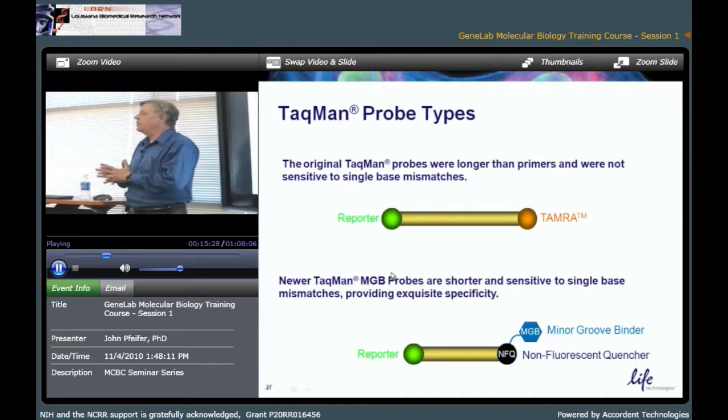If you go to our website, you'll see that the vast majority of our TaqMan assays are designed to eukaryotic targets, like human gene expression, SNPs, microRNAs, and so forth. Now, eukaryotes have a low mutation rate. So there's a lot of sequence homology, a lot of homologs. Great example, gene expression. There are a lot of homologs there. Very few base mismatches between the homolog and the target in many cases.